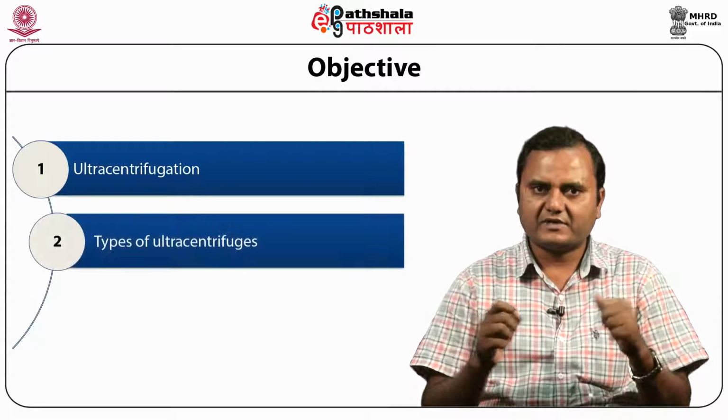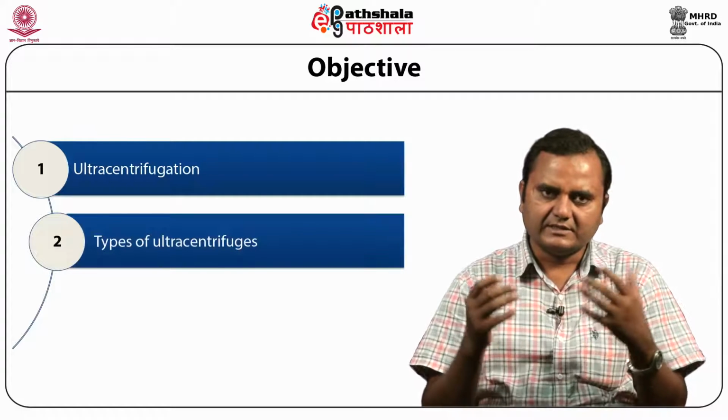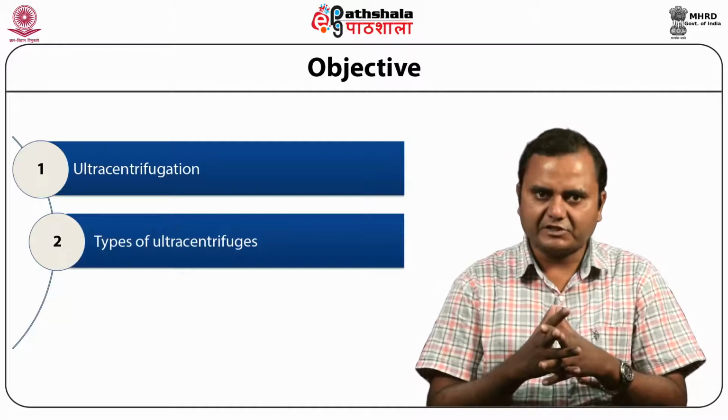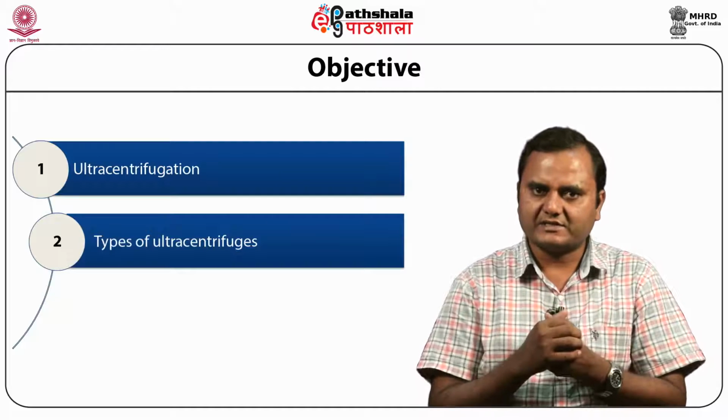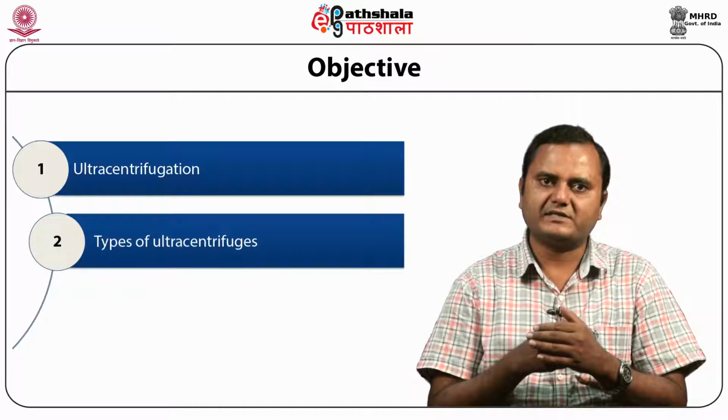Then the types of ultracentrifuge. There are two types of ultracentrifuge. One is the preparative and one is the analytical, based on their application. So there are two types of ultracentrifugation. We discuss a brief introduction about both these forms of ultracentrifuge.